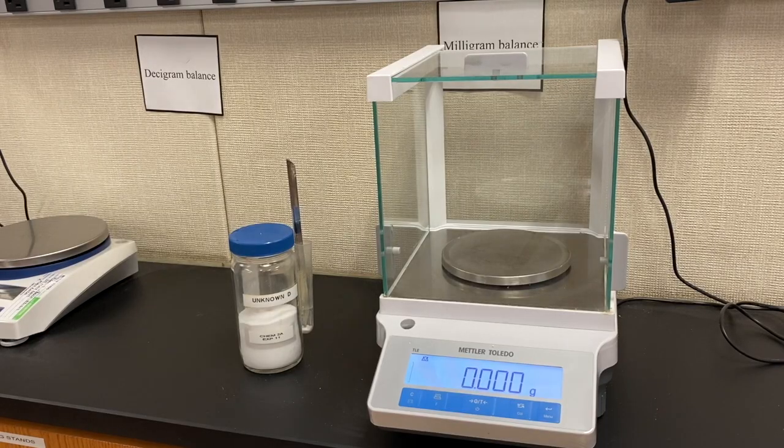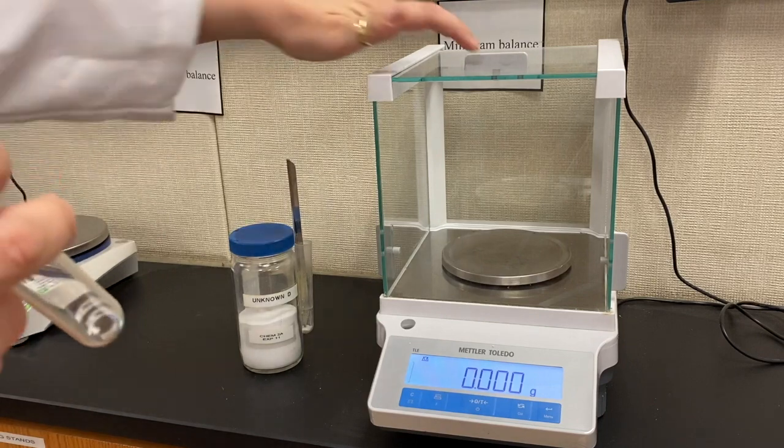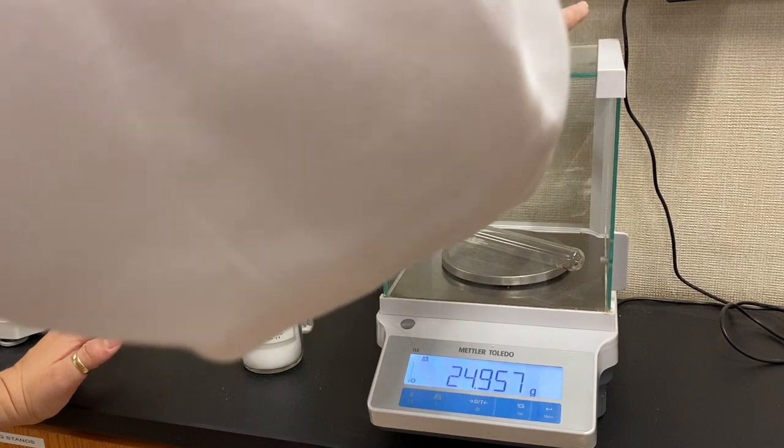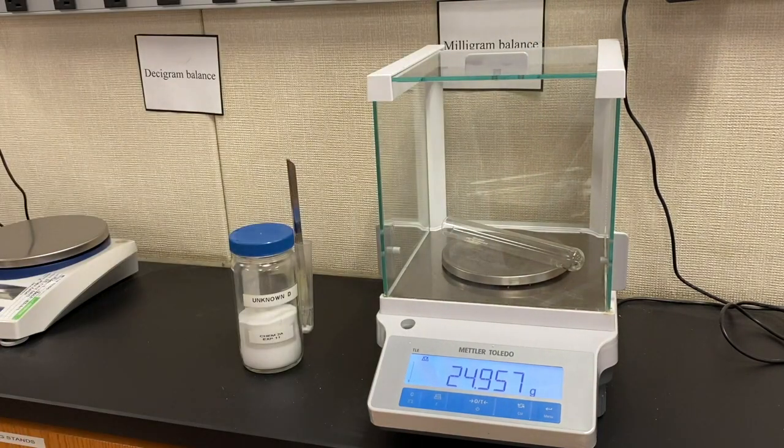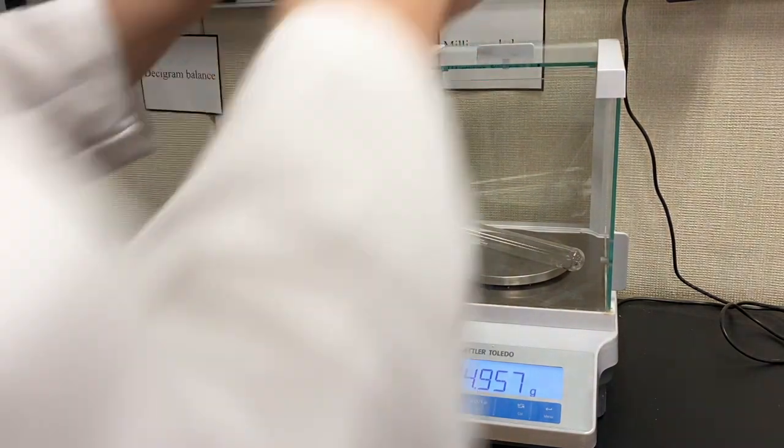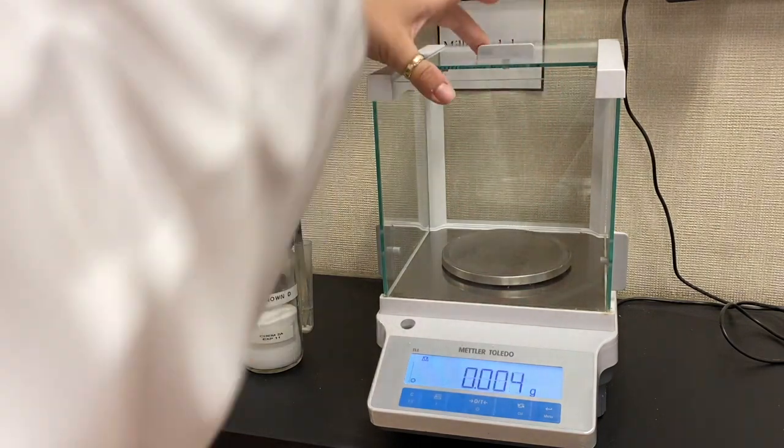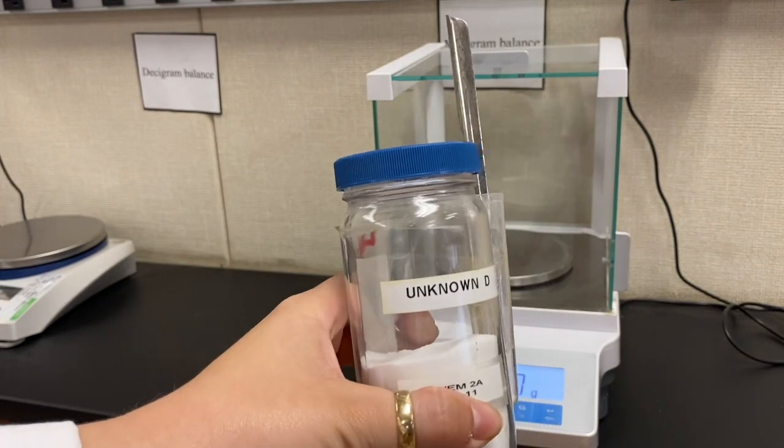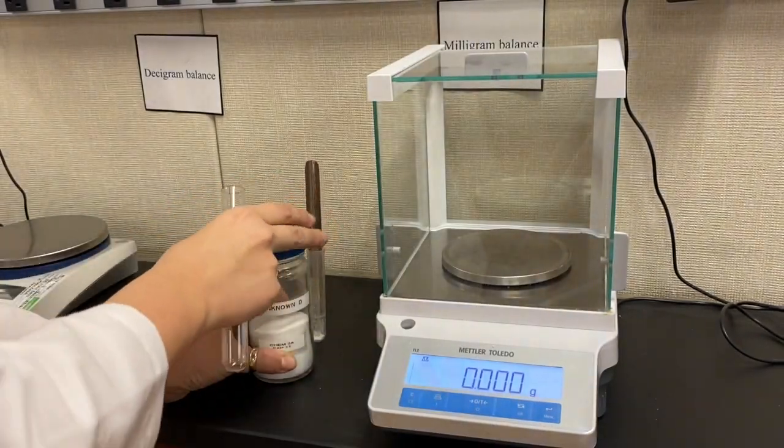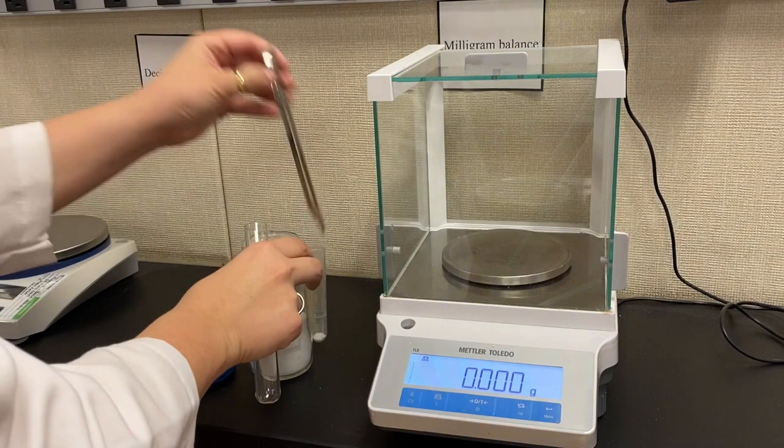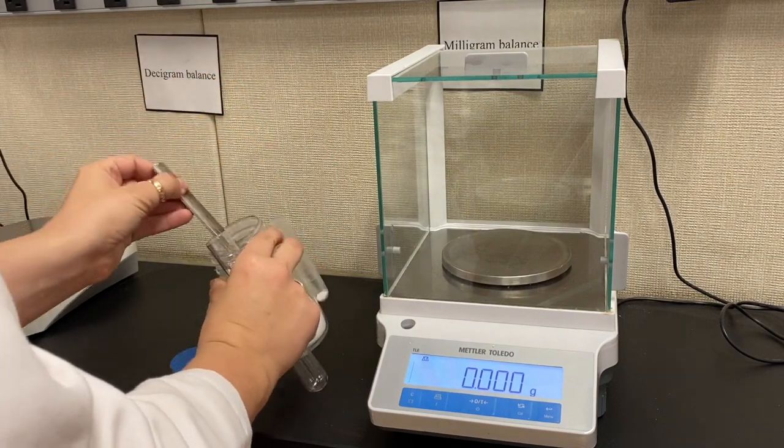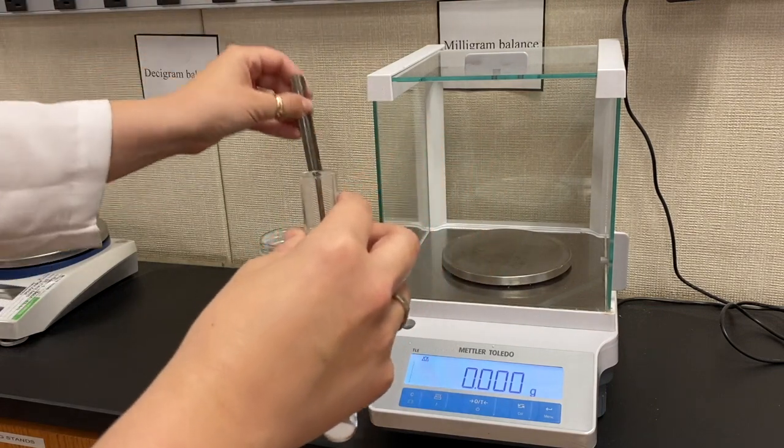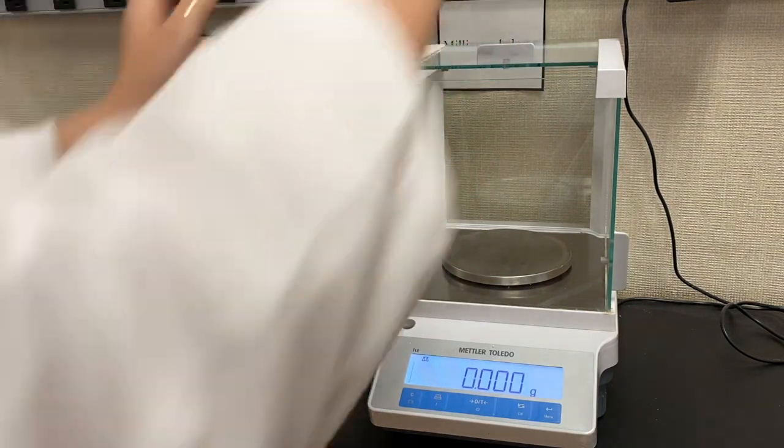Now look, we're back at the scale. So new empty test tube. We mass it. Ta-da! And same thing. We add about one gram of unknown D. Exciting. And we mass it.